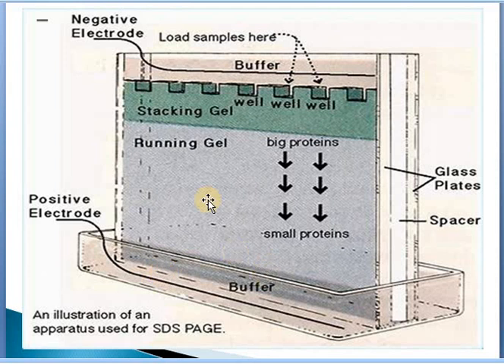So this is the gel plate during the process of separation. The first part, the stacking gel, helps in aligning the proteins before separation. Once the proteins have crossed the stacking gel, they reach the running gel. Based on molecular weight, separation of proteins will be achieved. The molecules with high molecular weight will be in the topmost layer. Then, smaller proteins of low molecular weight will migrate faster. Once the process is achieved, how shall we come to know that the process is over?